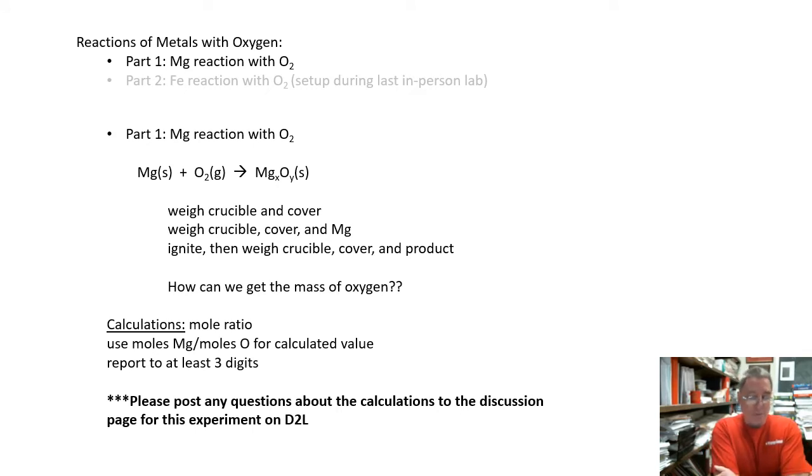Anyway, so pre-lab for this, the first thing I just want to stress is that we're not doing the calculations in the lab, and the TAs are there to help you do the experiment and obtain the data. But because of the COVID pandemic and the physical distancing, we've been asked to just get the data and then leave.